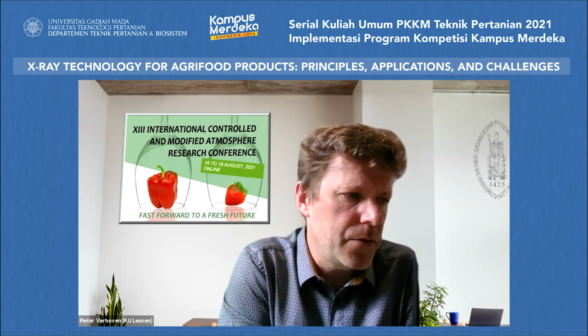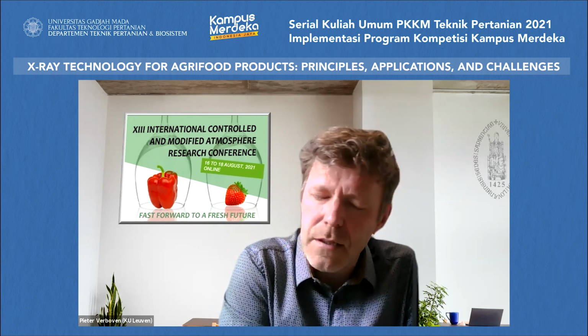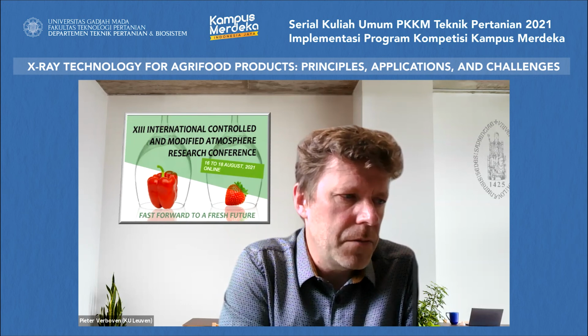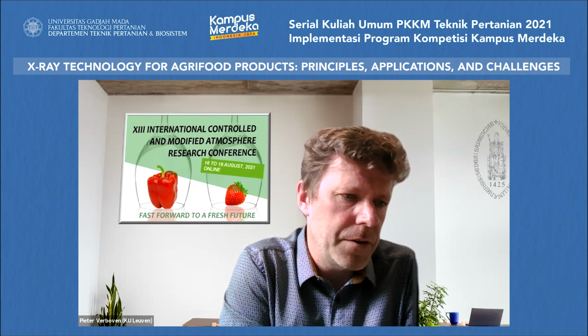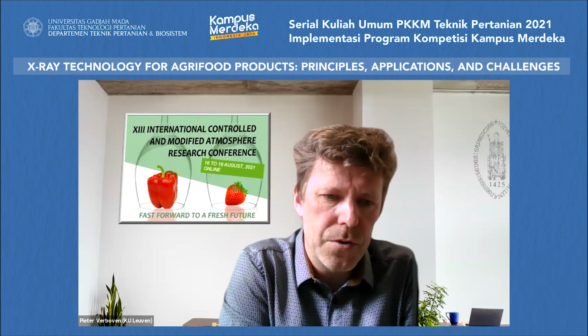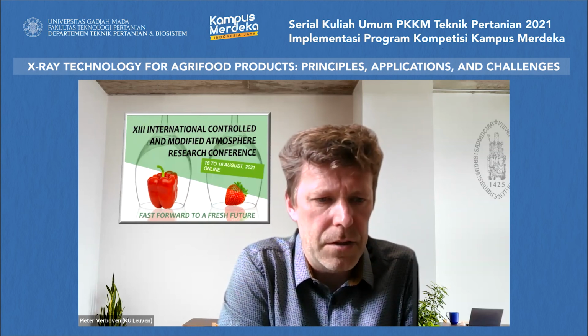The price of those instruments ranges from about 100,000 euro for the cheapest one to several hundreds of thousands of euros, depending on what level of resolution you want, sample size you want, scan time, all these things you need to be aware of.